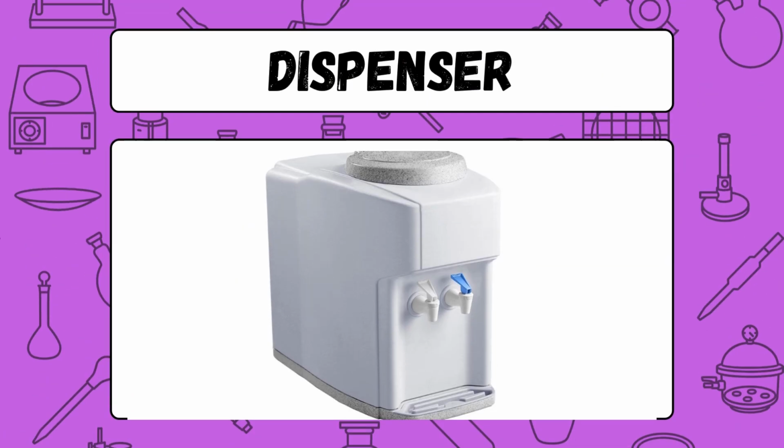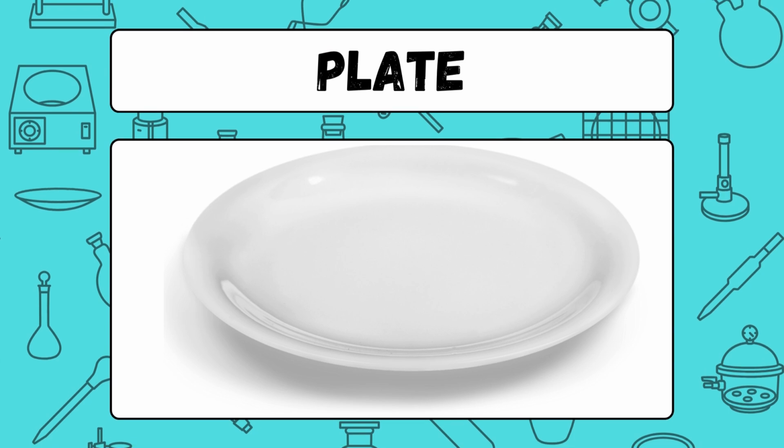Dispenser. A dispenser is a device used to evenly dispense small amounts of liquids or powders. Plate. A plate is a flat, typically circular surface used in laboratories for holding or cultivating samples.